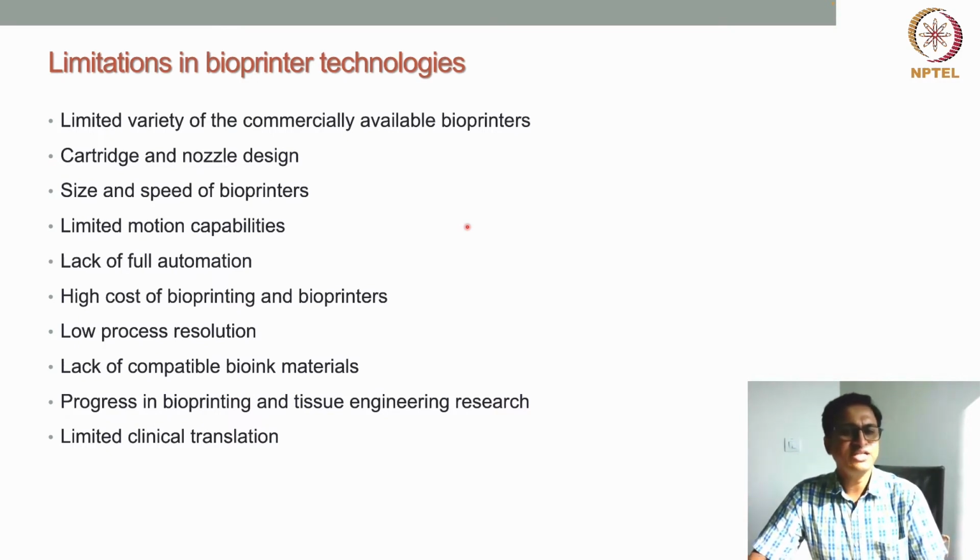Like there are limited variety of commercially available bioprinters. If you see, there are only very few players who actually manufacture and supply this kind of bioprinters. There are very few, right? But what we need? We need different types of bioprinters. If there are multiple players, then also the bioprinters will become affordable. So that is another thing.